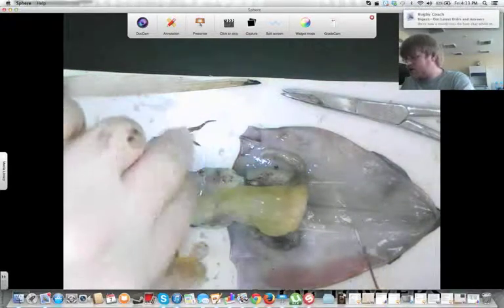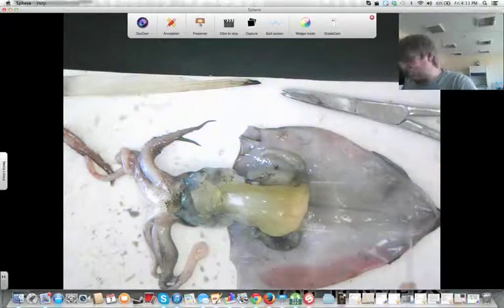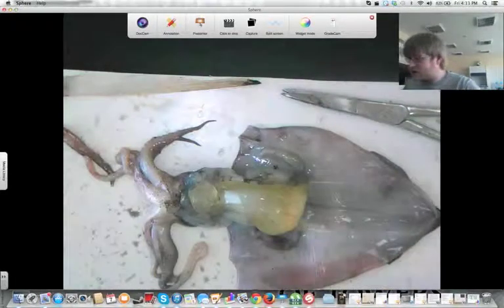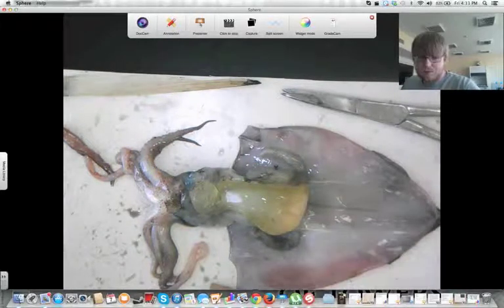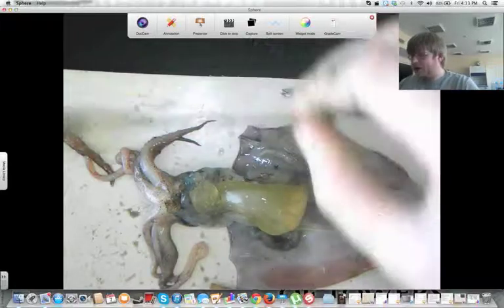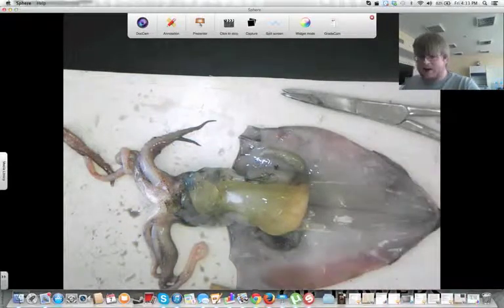Now, you'll also notice that when I pull this up, what I've done in order to pull the internal organs of the squid up is I've just cut the connective tissue along the sides here. You don't need to actually cut the organs out, but you can remove them. Now, what you will find here is this, which is the squid's pen.